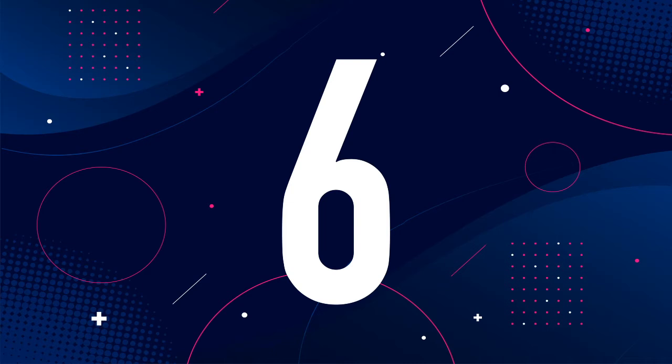We can have our phase contrast though, which is like a combo of the two. Phase contrast, notice the background's a little lighter, so we're not blocking it completely. We're getting a little light shining off the cell, but we're also letting light pass through, so we're able to see a little bit more of a contrast or detail. So that's what our phase contrast is doing. And again, we do that with our iris diaphragm. That's the beauty of the iris diaphragm.